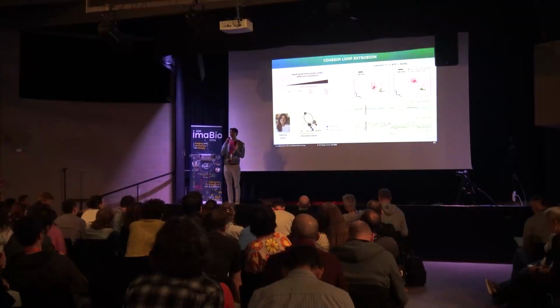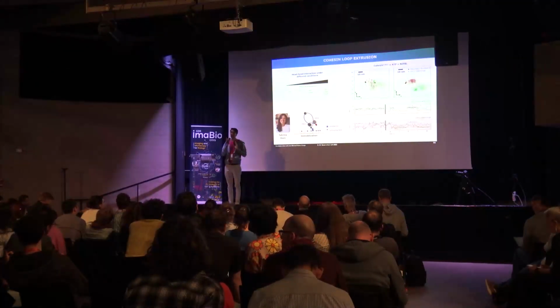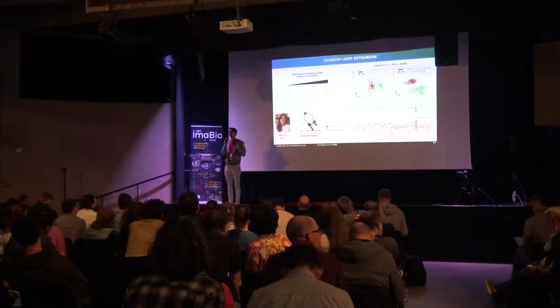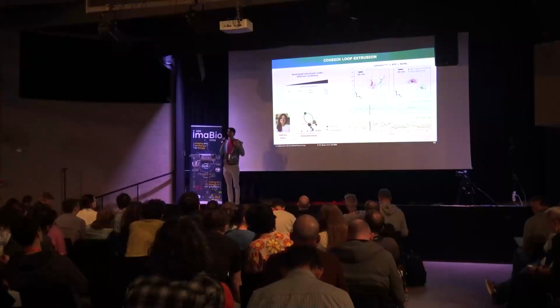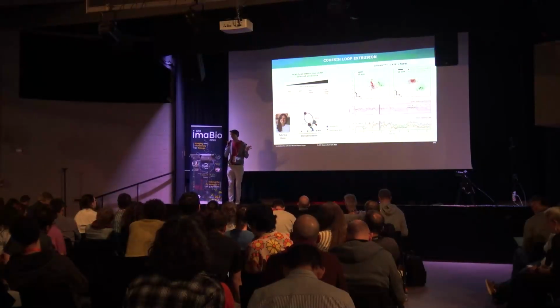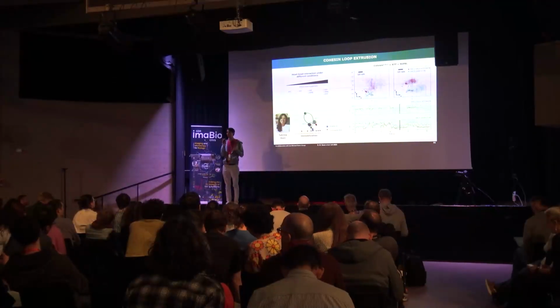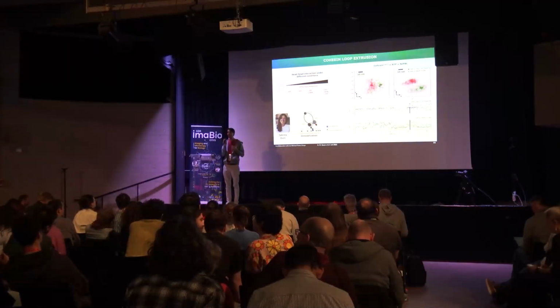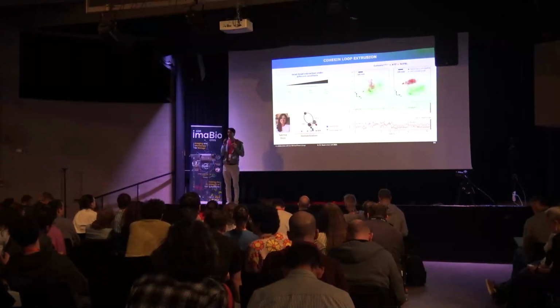So actually, if you mix top hats and vortex beams, vortex beams only probe the XY and don't probe in Z, mostly. So that's a way to escape the differential axial-lateral probing of the top hat only strategy. But for that to manifest, you have to have a dipole that is not moving, which I never see, to be honest. So I don't care so much, but we are aware.